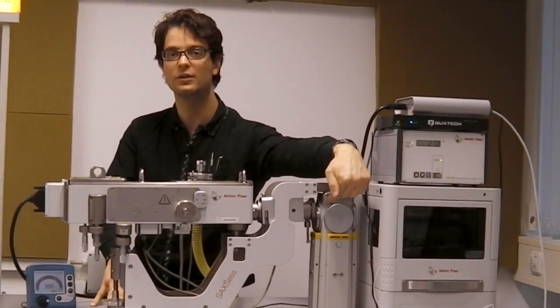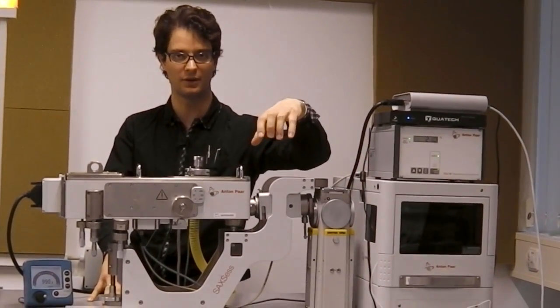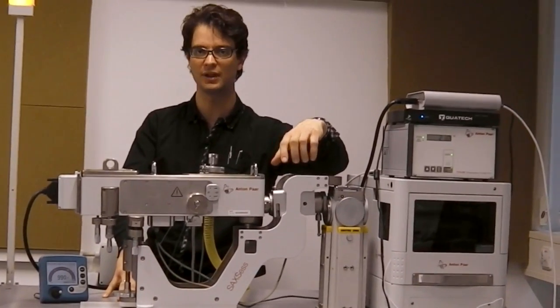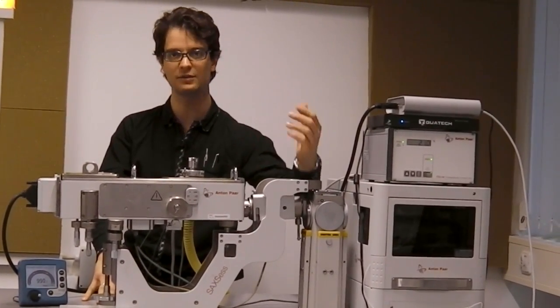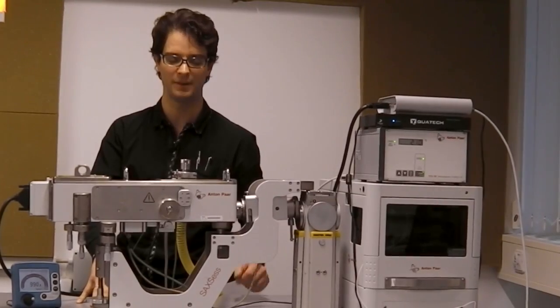X-rays come out on this side and enter the monochromator. This is a multi-layer optics designed to focus and monochromatize the beam.